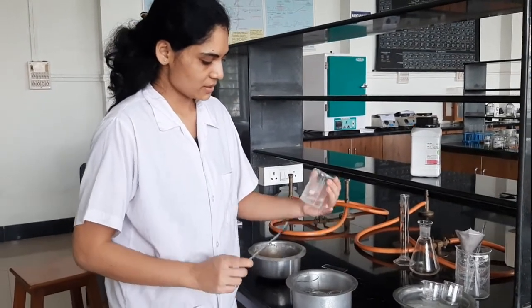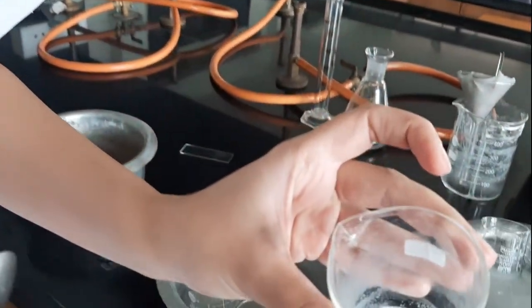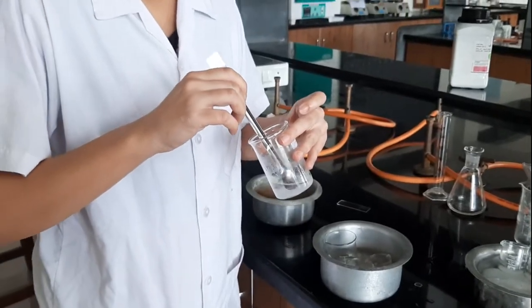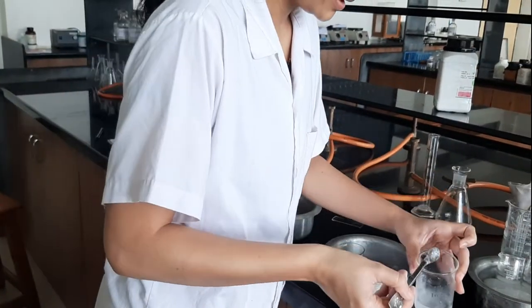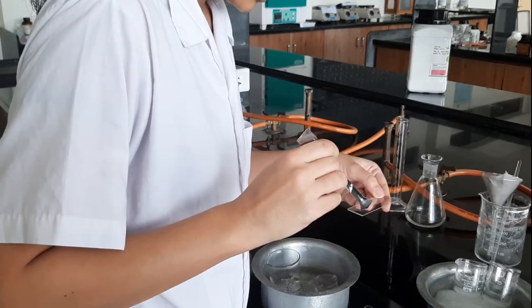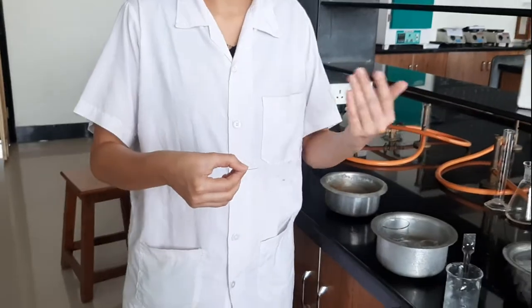Now you can see here, this is our 10 minutes sample, and if you observe the sample carefully, we have got crystals here. Now we will take a small amount of these crystals on a glass slide, cover it with a cover slip, and determine the particle size with the help of the eyepiece.